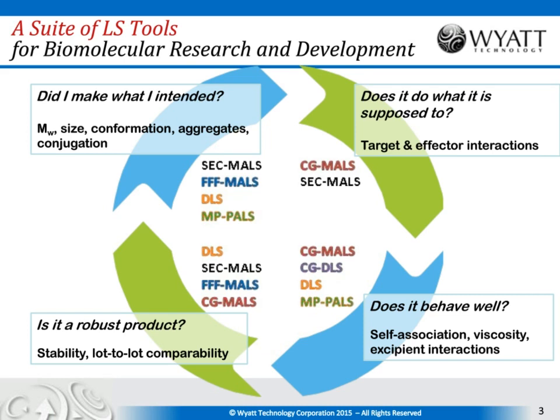The acronyms that are in this diagram are all light scattering based techniques, and we'll go through each one of them to learn a little bit more about them, so I won't belabor now what they all stand for. But the idea is that each of these techniques, as we go through them, can be applied to answering these critical questions.